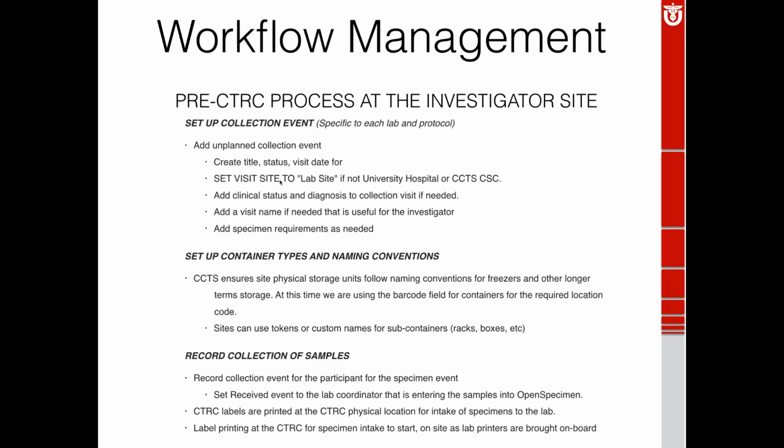What we're trying to do is avoid the management of all this stuff being put onto the processing lab, and that's currently what's happening. They've got a couple of different samples, and they spend a lot of time helping people walk through the different applications they use to get samples ready to be dropped off. That causes a lot of different issues across the board, whether someone's actually having to enter in data that takes too long, or there's missing data, or they just put in placeholders when they really would rather not, that sort of stuff.